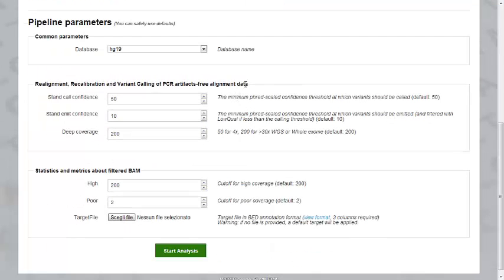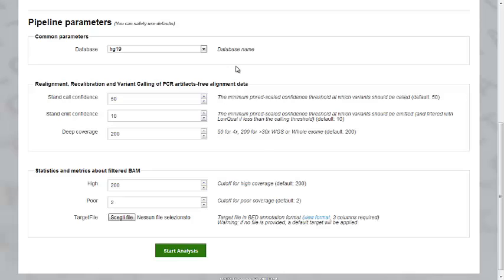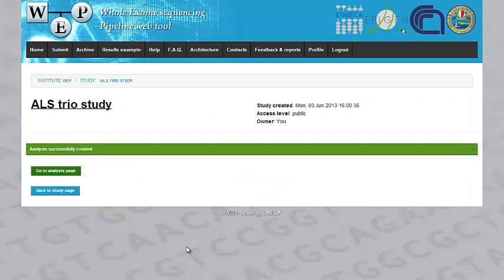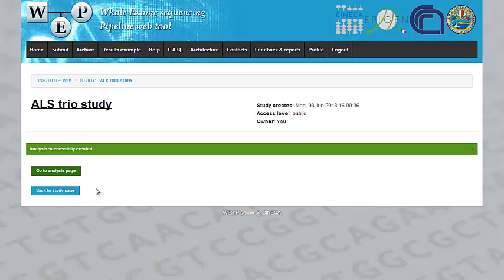And you can choose from several parameters of the default pipeline. Or you can just safely leave the defaults. When you're done, you click on the Start Analysis button. And your analysis is created and will be submitted to the cluster for execution.